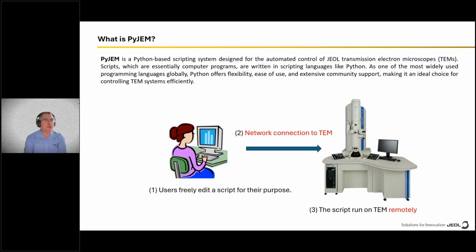JEOL created PyJEM to enable you to control electron microscopes using a Python interpreter. What it does is that it establishes a connection with the microscope and gives users access to all lenses, deflectors, and the complete electron optics system.